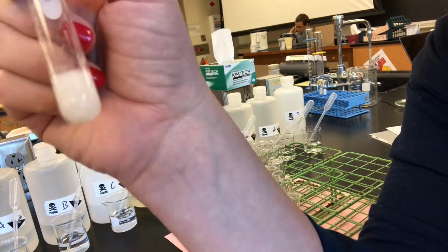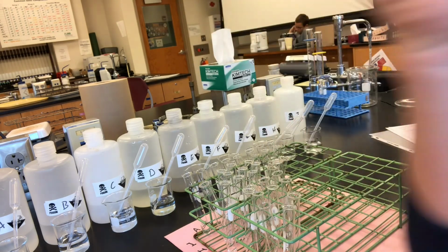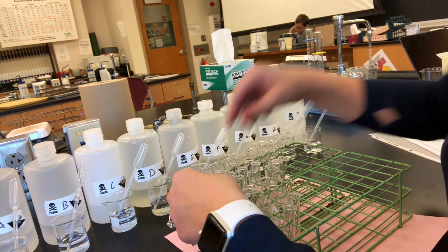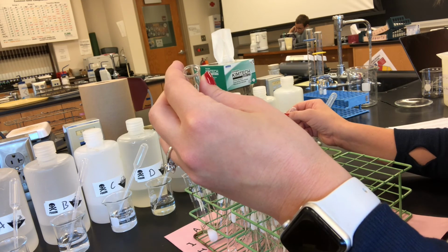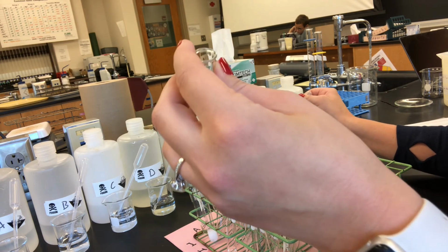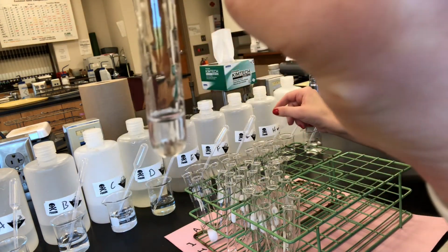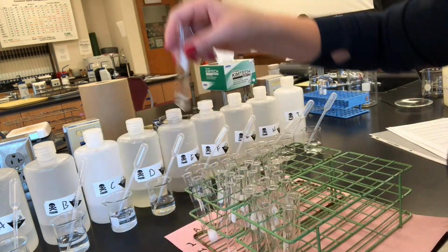All right. Anyway, white fluffy precipitate. That's the important part. So A and H had a precipitate. Now let's do A and G. A and G. Nada.